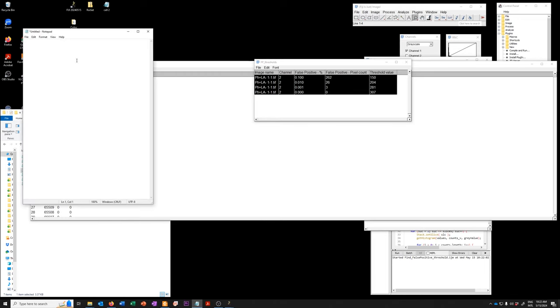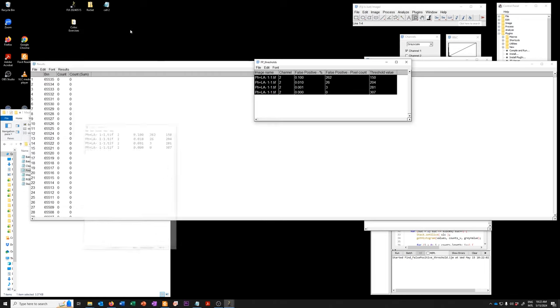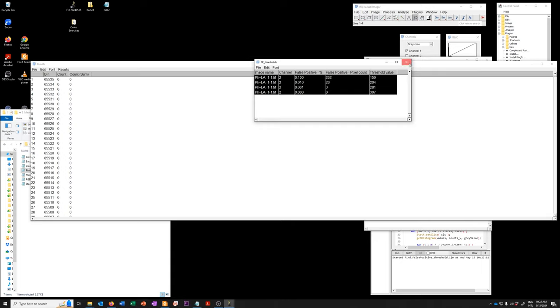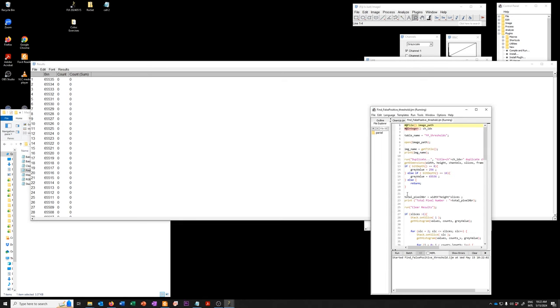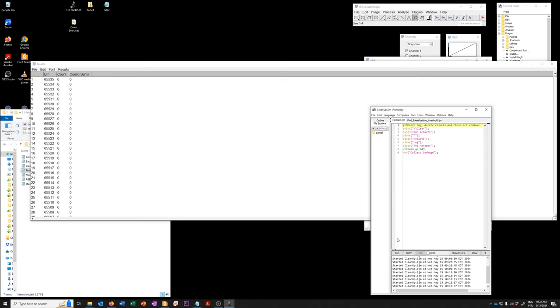So I'm going to copy these values just to a notepad and I'm going to redo this on a few of these images to see how much they vary. So to redo it, something I discovered is you have to close everything. So I'm just going to close this one and then the rest I can close with my cleanup macro.